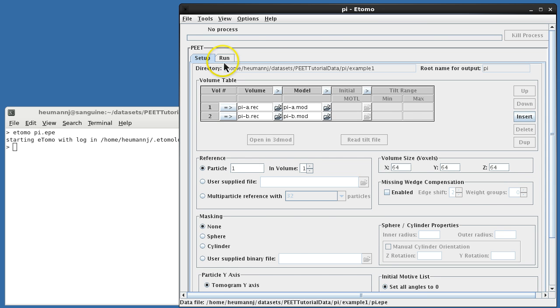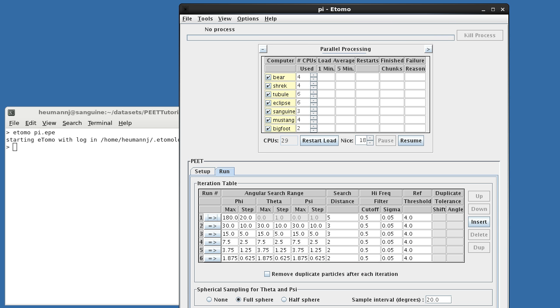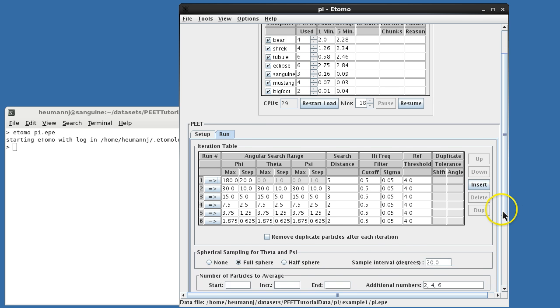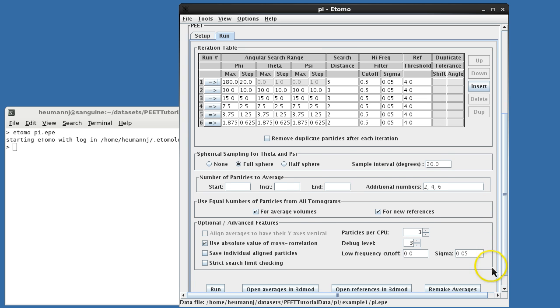That completes the settings on the Setup tab, so we'll move on to the Run tab. The Parallel Processing section, at the top of the Run tab, determines how work is distributed among processors on the local network. Consult the iMod documentation for instructions on how to configure and use these controls.